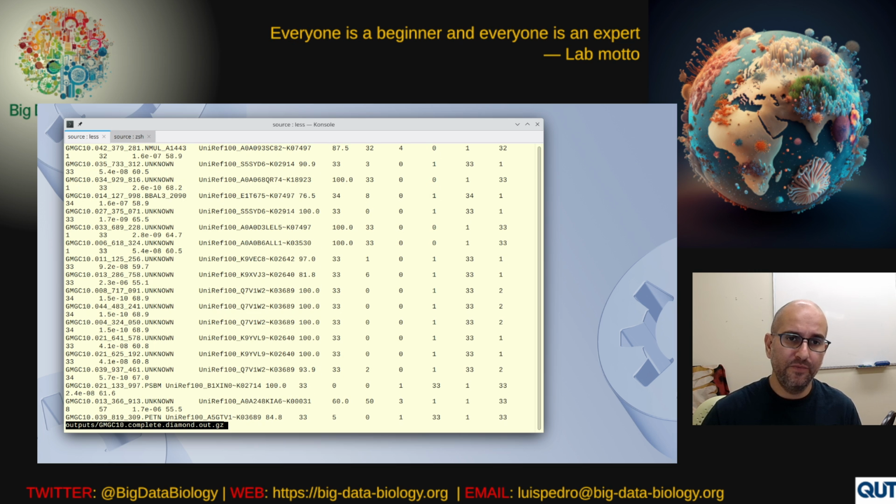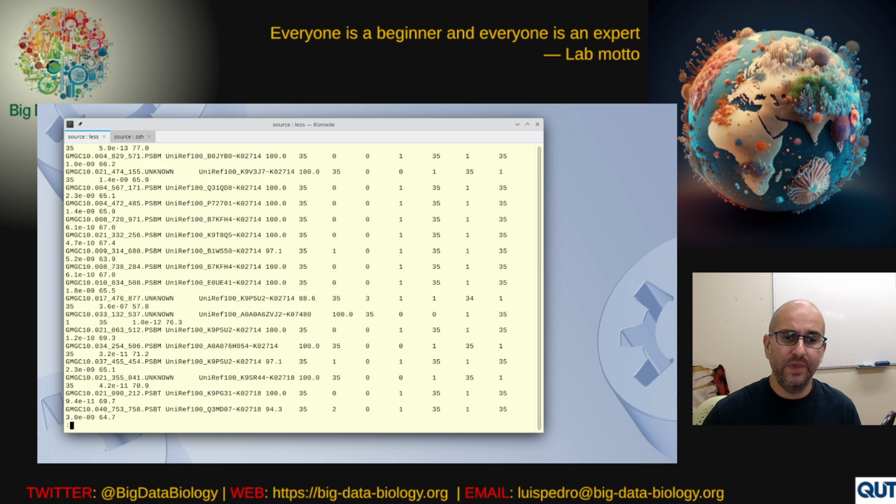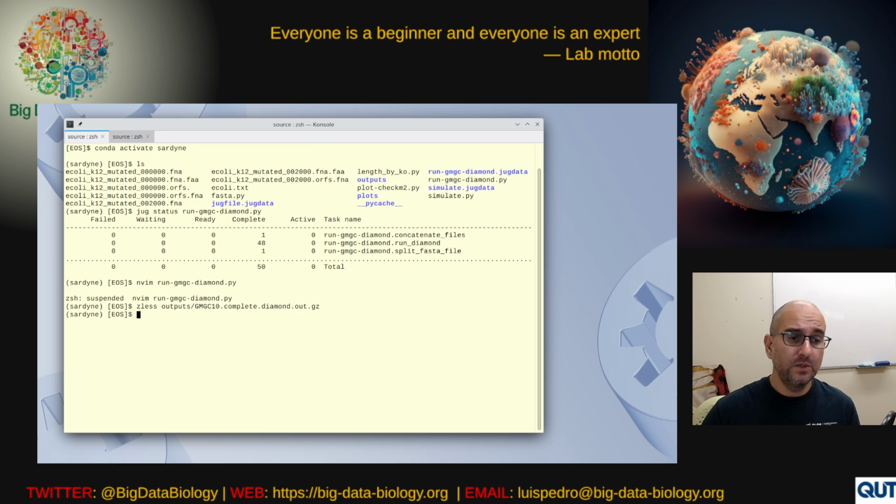Now we have a single file with everything from the GMGC. So we got basically the same results as if we had done this big diamond run that we tried the first time, except now it was a little bit more robust, because each one of these 48 tasks took anywhere from 1 to a few hours. If something went wrong and my computer had to interrupt it, that was fine. I would just interrupt that one task, and then it would pick up from there.